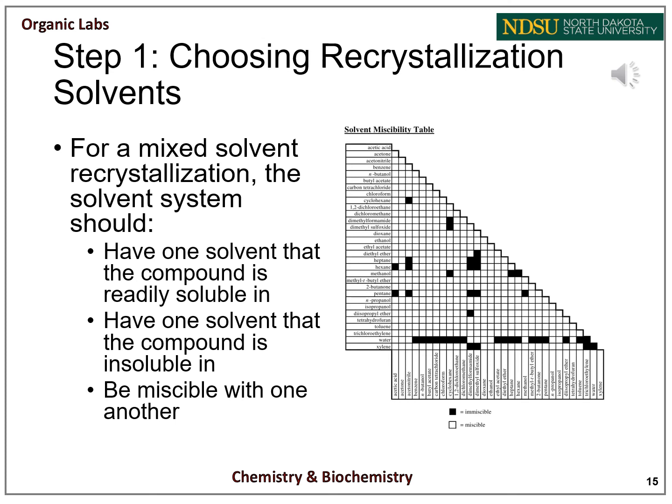This is a nice chart to reference when looking at a mixed solvent recrystallization, especially if it's going to include water. Properties of a solution of miscible solvents can change with temperature. For example, a solution of ethanol in water at high temps will behave as an alcohol, and at low temperatures will behave as water.